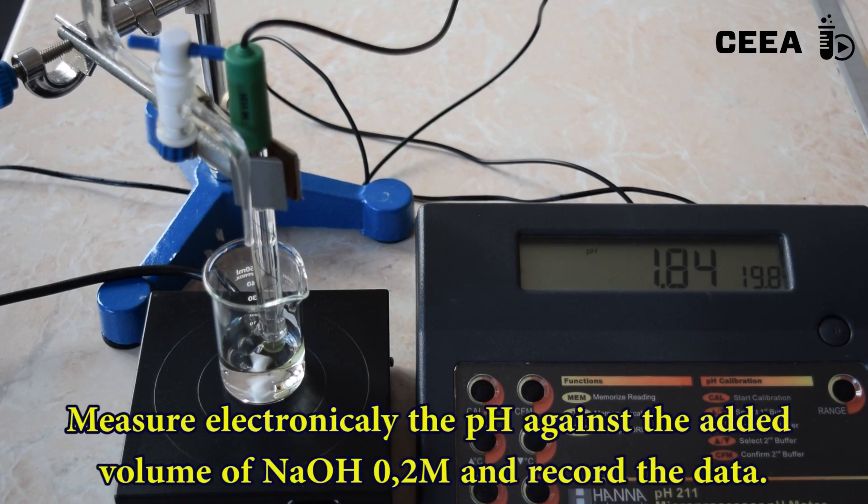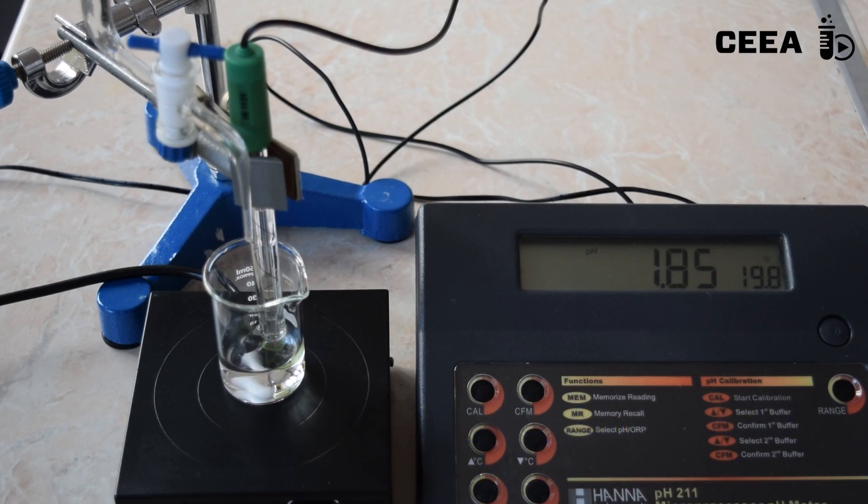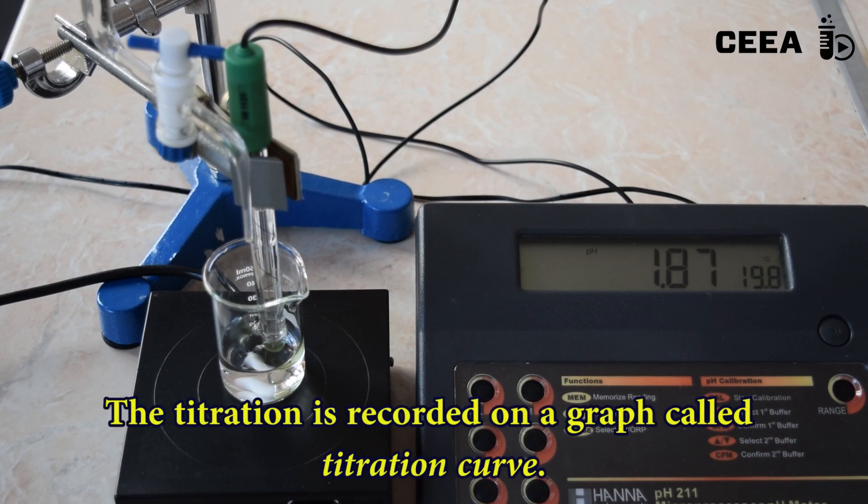Record the pH of the sample at each 0.5 milliliter of added base. If you plot the pH against the volume of base added, you will get the so-called titration curve.